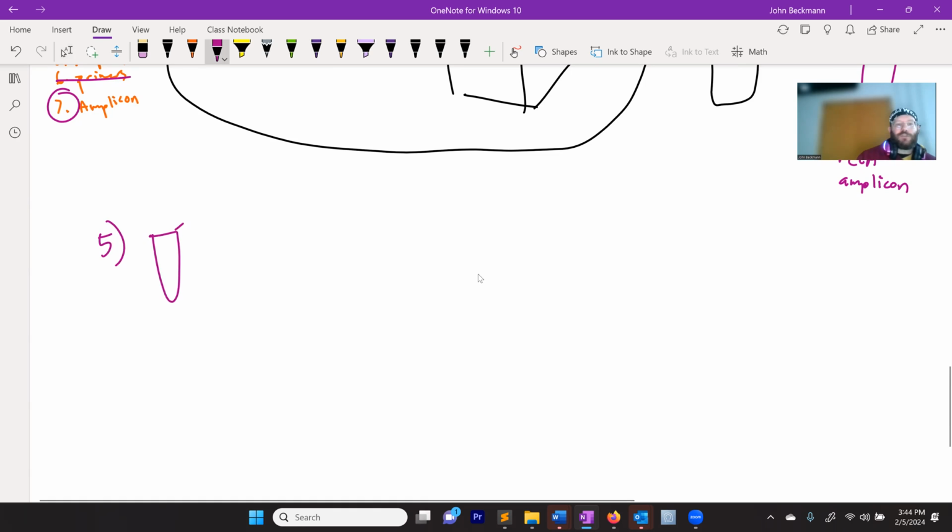So now we have a tube with our purified RecA gene inside of it. And where does it need to go? Now's your big chance. Where does the gene need to go? Into the plasmid. Yeah. So in parallel, we had set up, maybe step 0, a mini prep.